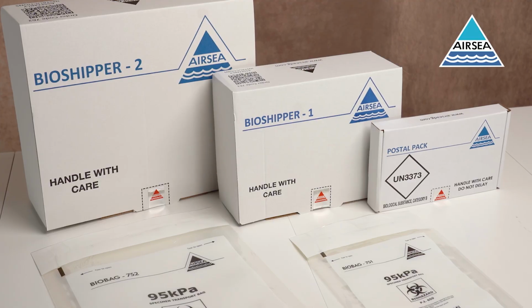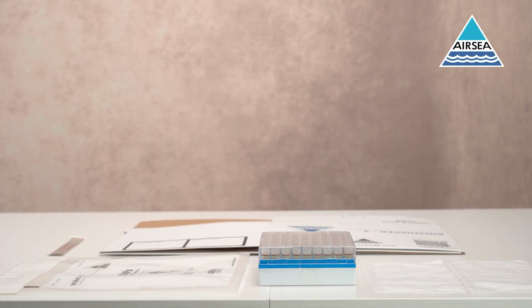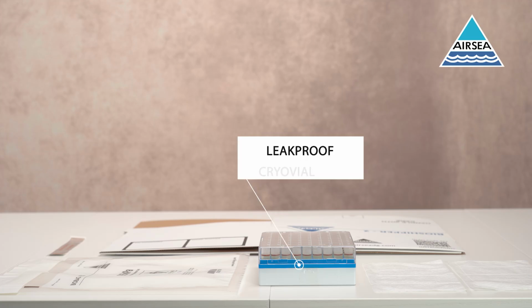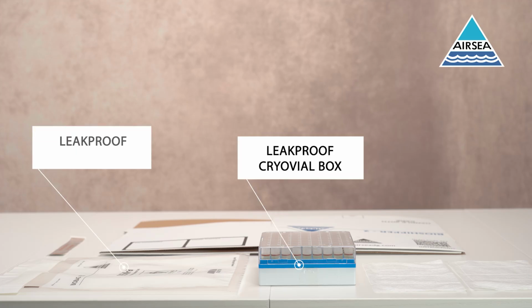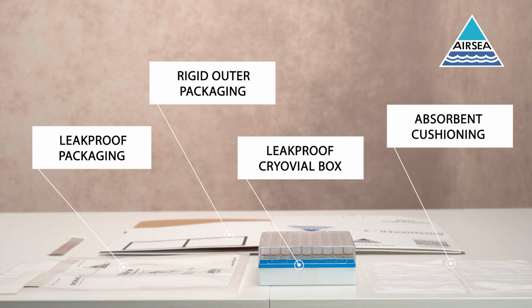Category B infectious substances require a triple packaging solution, which, in this example, consists of leak-proof cryovial boxes, a leak-proof secondary packaging capable of withstanding an internal pressure of 95 kPa, and a rigid outer packaging. Absorbent cushioning will also be required.